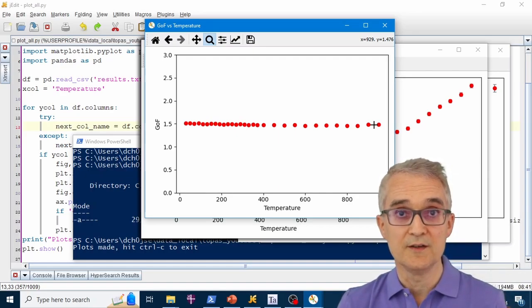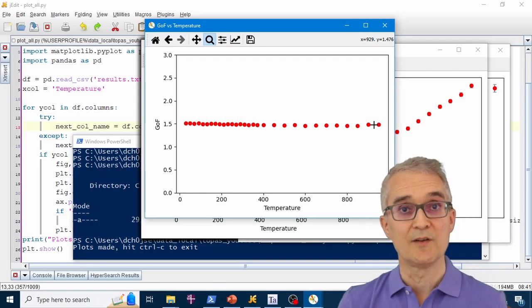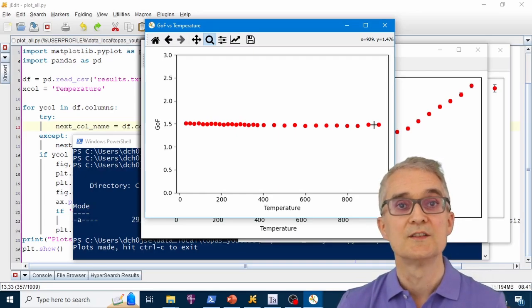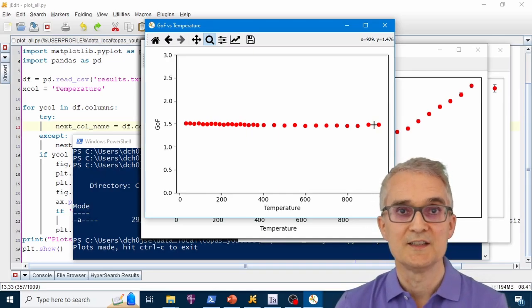All of the files that you need, as I say, are going to be on the tutorial page, which was linked at the beginning of the video. And if you look on the wiki, there are some background notes which take you through some of the more theoretical side of this and some of the tips and tricks for doing this type of analysis properly.